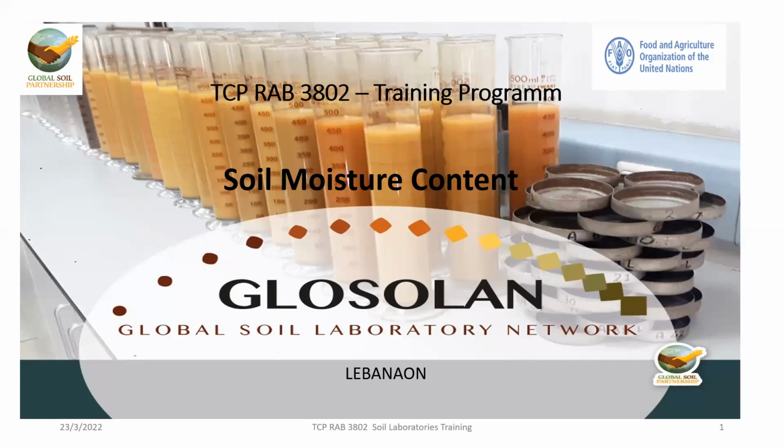Today we are going to describe or illustrate the procedure for determination of soil moisture content.